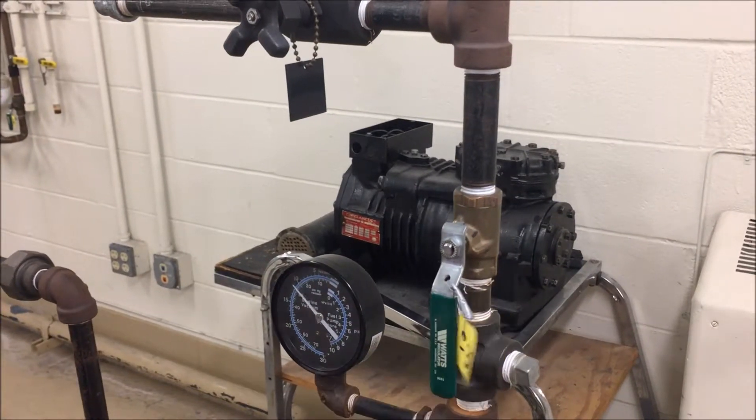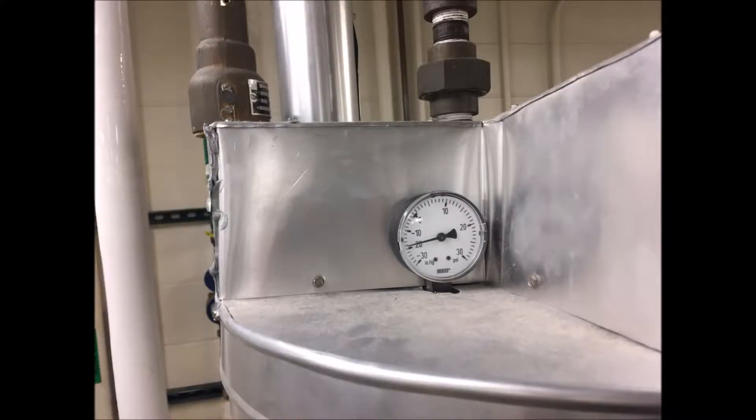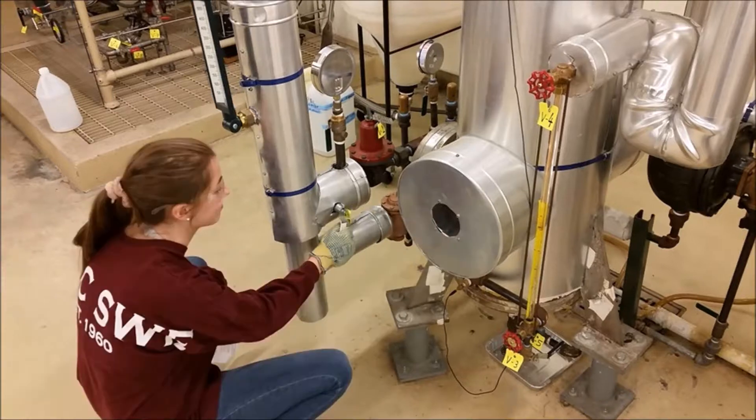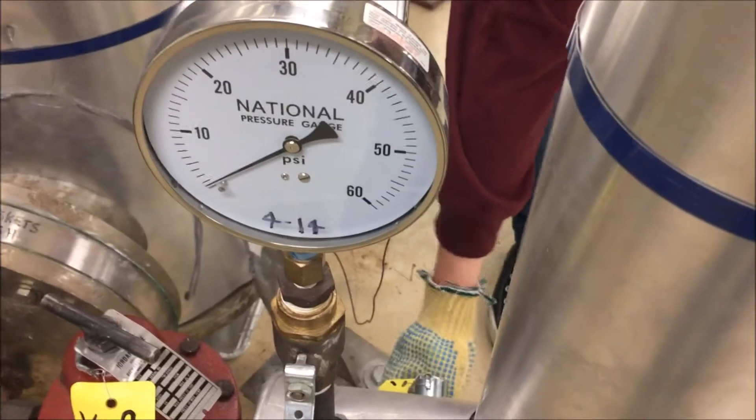Open V31 to apply vacuum to effect B. Your steam gauge on top of effect B should look like this. Always wear heat-safe gloves when dealing with the steam lines. To turn on the steam, open V1 until the pressure gauge upstream reads 55 psig. You might hear a loud noise, which is normal. Monitor for about 10 minutes until steady.